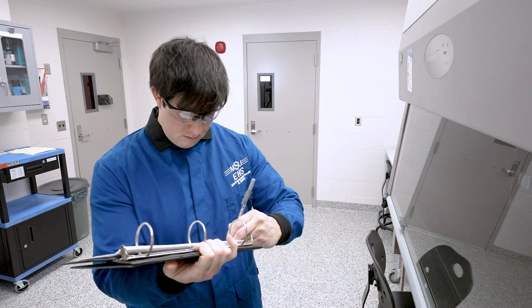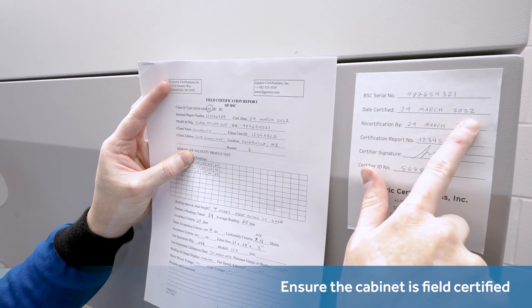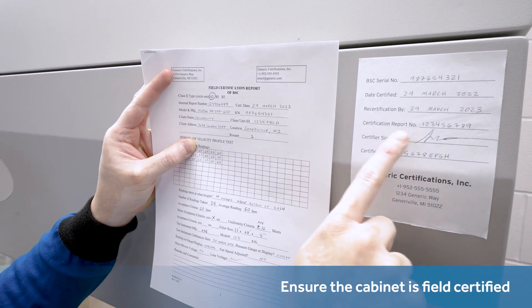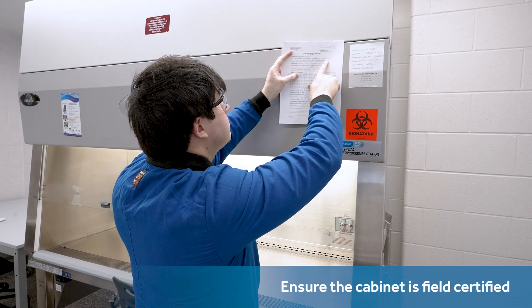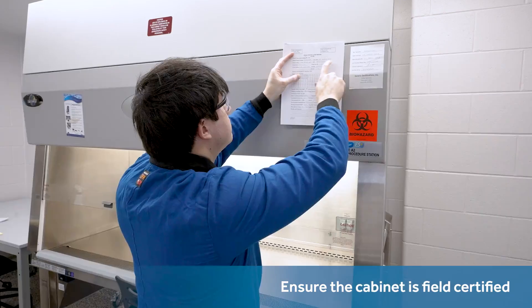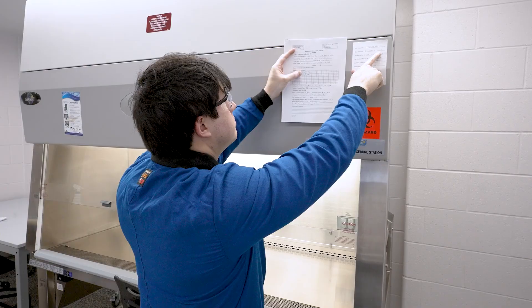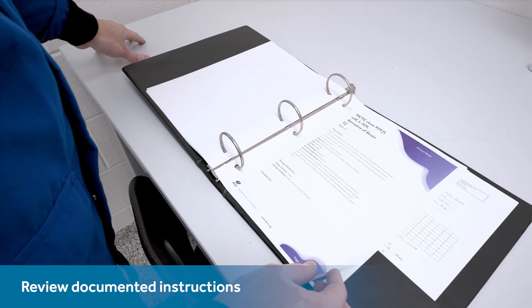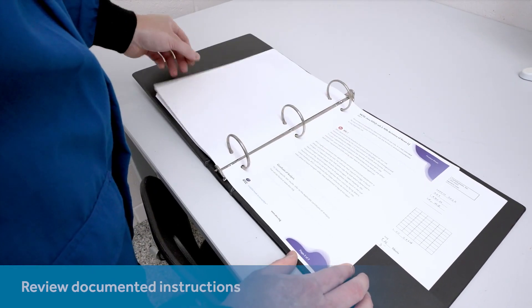Be certain the cabinet is field certified. Industry guidelines emphasize assigning field certification to knowledgeable technicians. They outline many instances that require this field certification, such as after setting up a new cabinet, when a year's time has passed, when transferring it to a new place, or when performing technical work on it. Industry guidelines also emphasize documenting instructions for cabinet loading and unloading, as well as overall utilization.